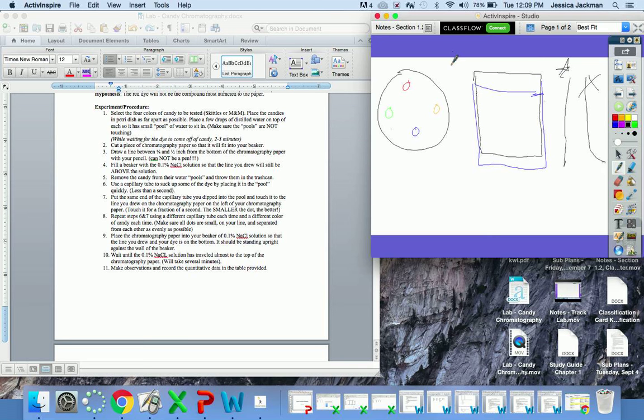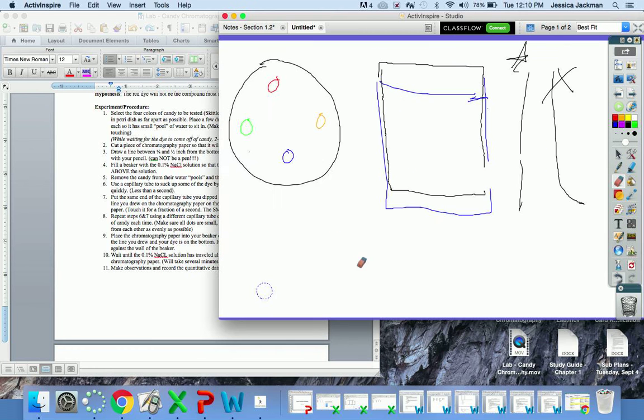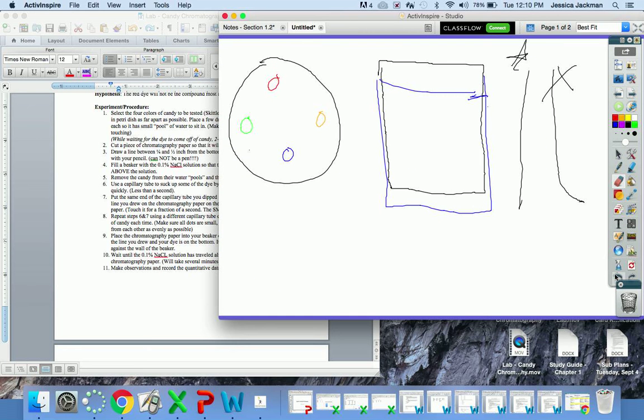Hey, you're going to cut out a piece of chromatography paper like so. By the time you get that done, whoever set up the candies, you can go ahead and take the candies off, because your water should have taken off some of the dye that was on the candy. Now you should have little colored pools. Okay? So when you get your chromatography paper, let me make this bigger, so that I can undo.